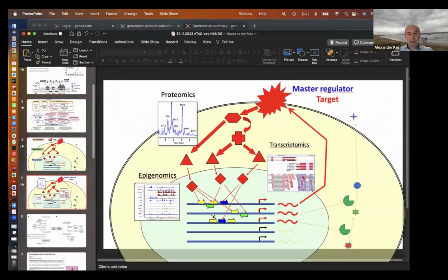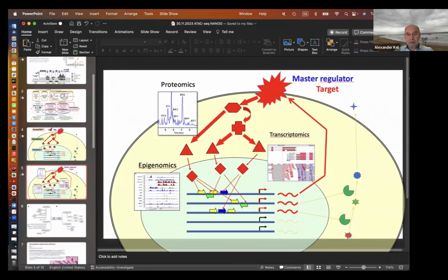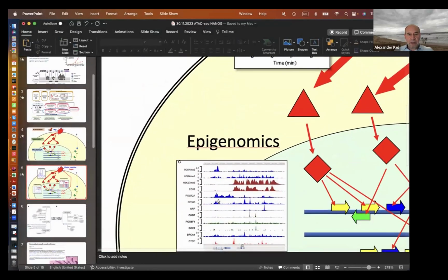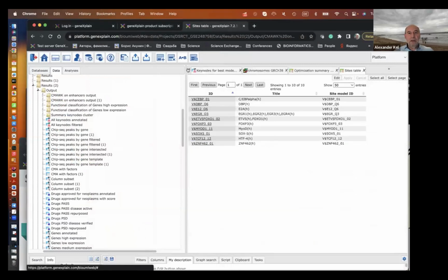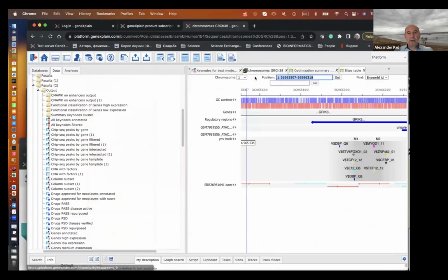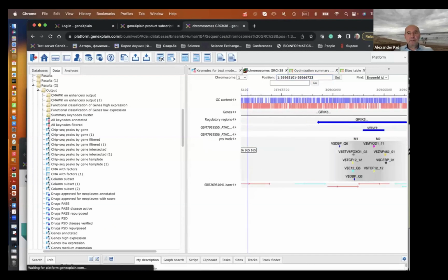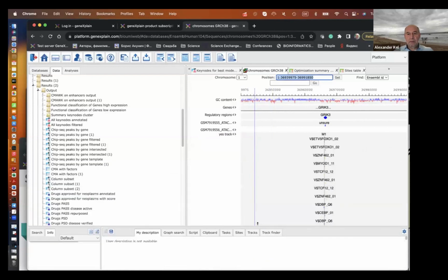And you can see here, for instance, on this picture from typical ChIP-seq, the same as ATAC-seq experiments, there are areas with small peaks and there are areas with very high peaks. And that's what you see also in our genome browser when you zoom it out, you see those peaks more clearly.